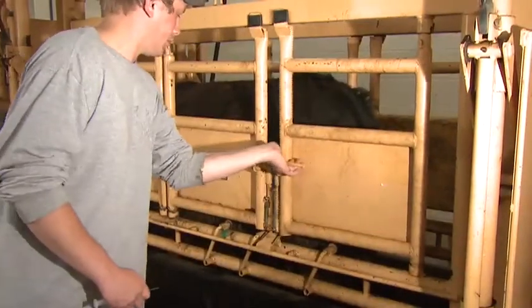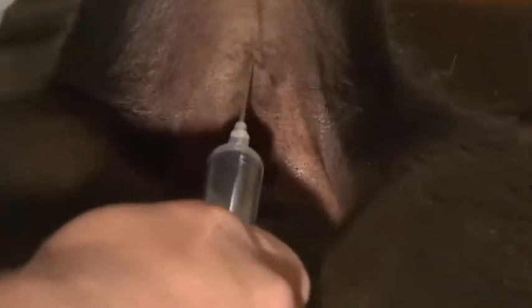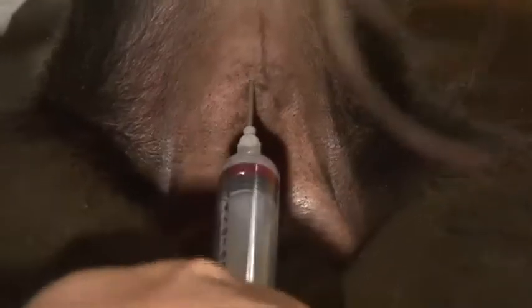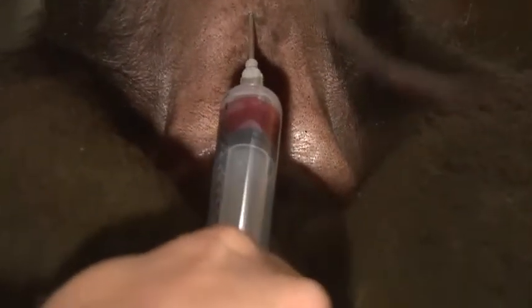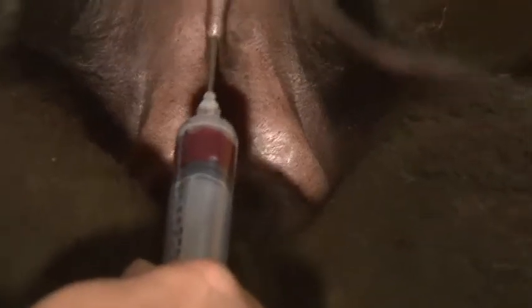Luke is now going to demonstrate how to pull blood from the tail of an animal. He'll lift up the tail, find the vein underneath, and stick the syringe in to extract a small amount of blood. Not very much is needed — certainly one milliliter is enough, though collecting more is fine.